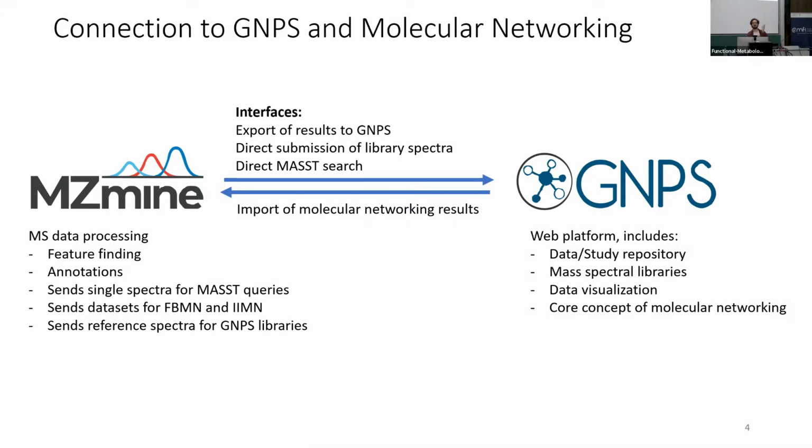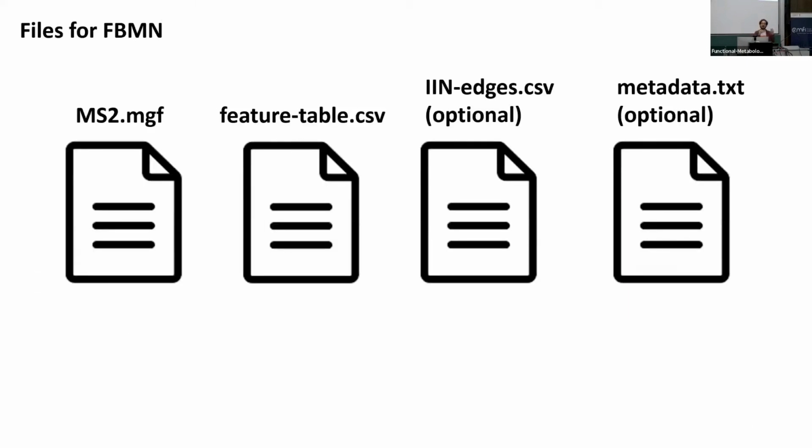And we just now used the quick start or super quick start interface, which I think is a very easy way to start with GNPS. But there are also later ways you can link up your data better and organize it better on MassIVE, because everything that runs on GNPS is also stored in MassIVE. So what did we actually push to GNPS?